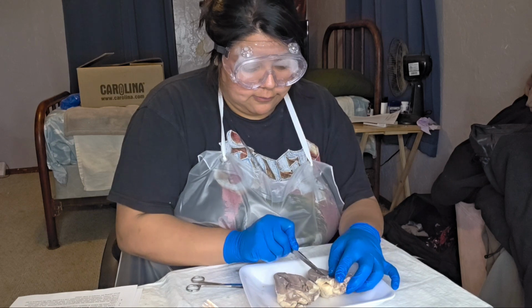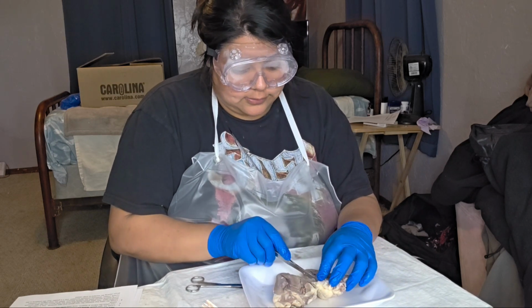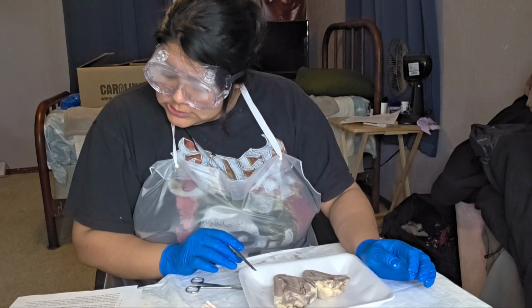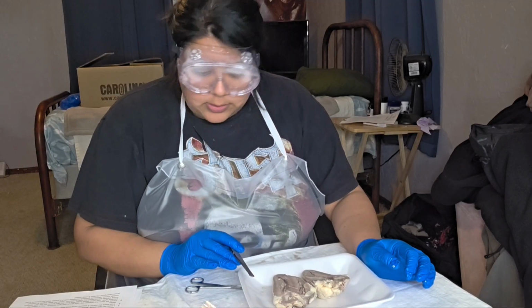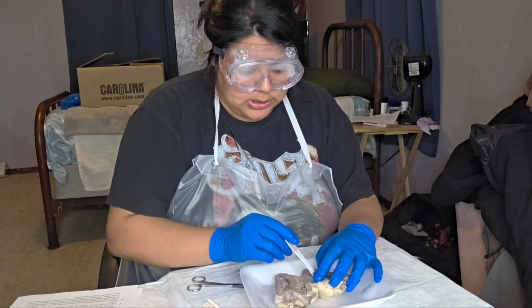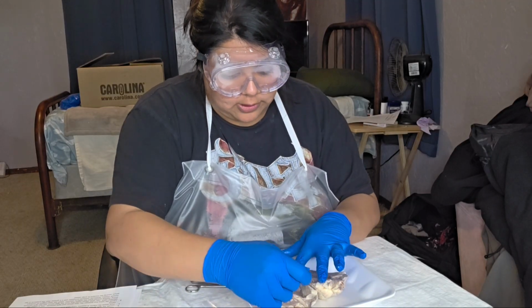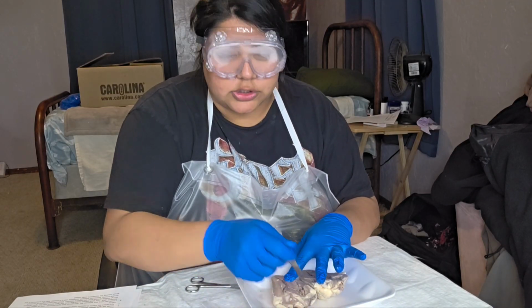So here are our two valves. Right atrium, so that's going to be here and here. This valve is our tricuspid valve.